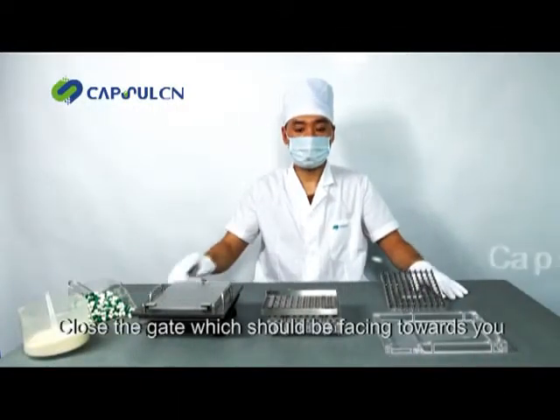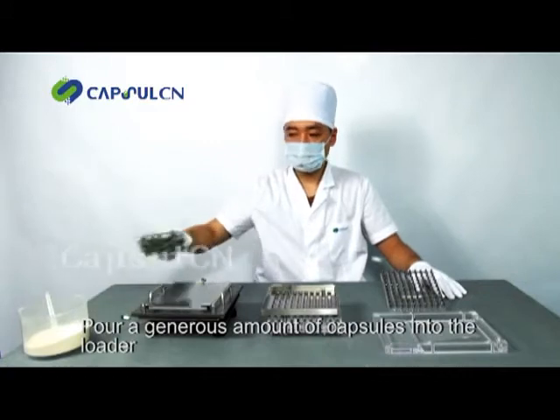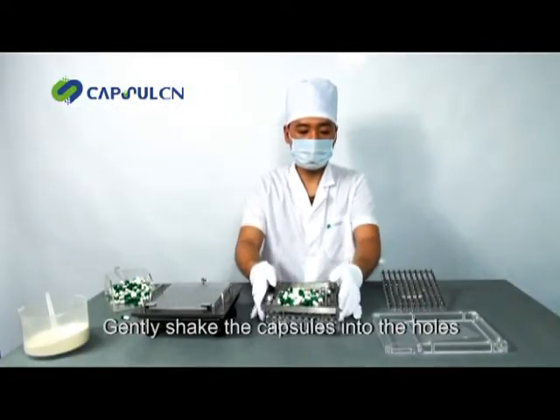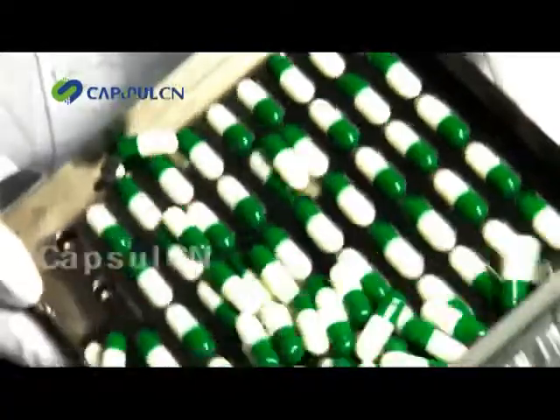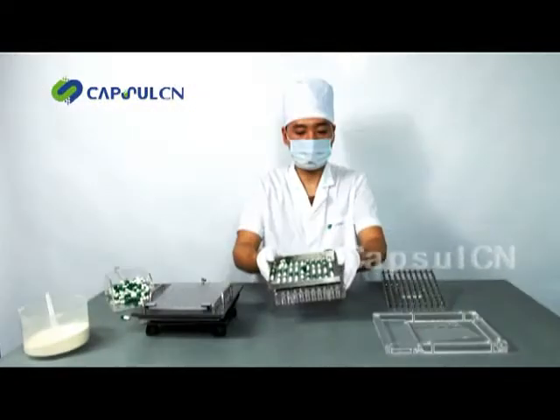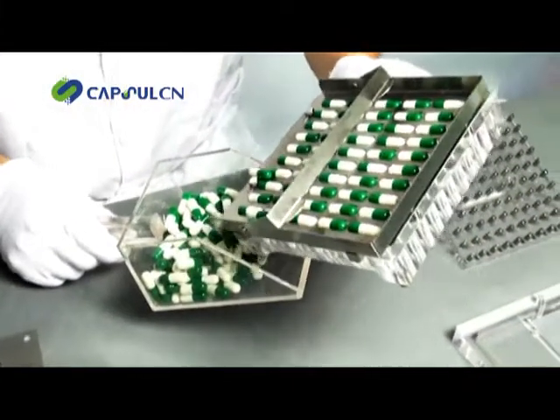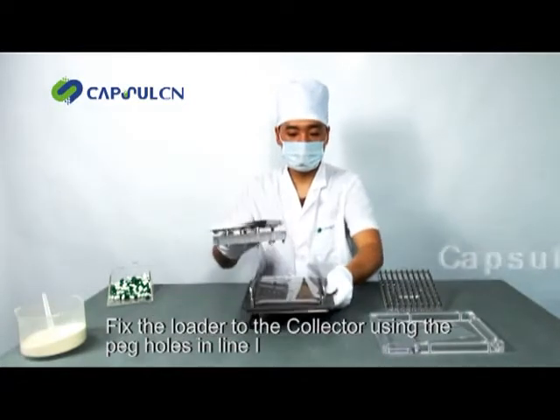Close the gate, which should be facing towards you. Pour a generous amount of capsules into the loader. Gently shake the capsules into the holes. Pour off excess capsules.